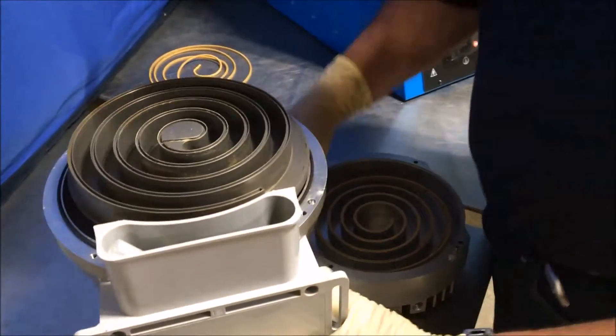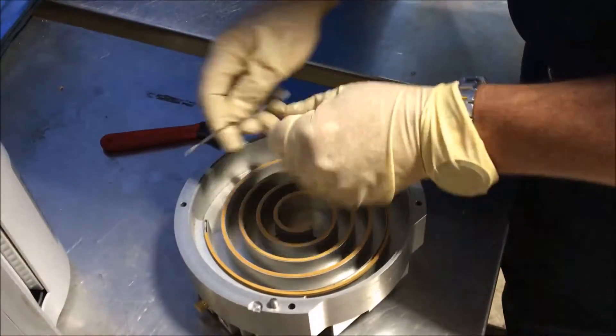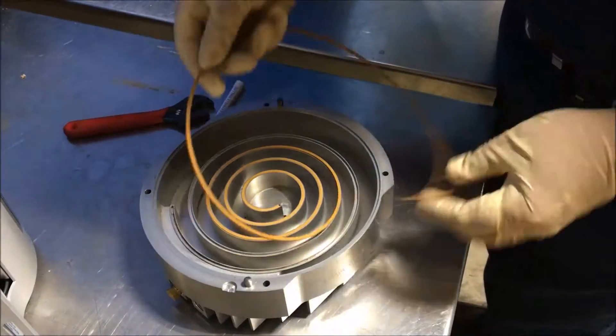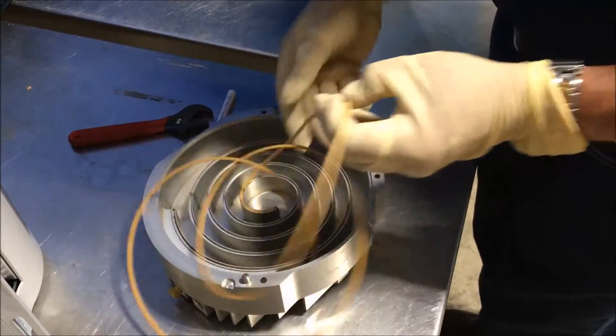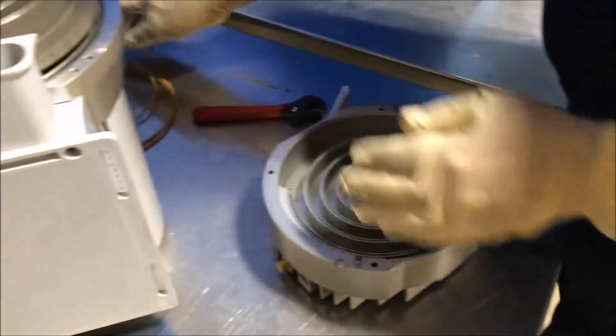Do the same to the stationary seal here. Set it aside.